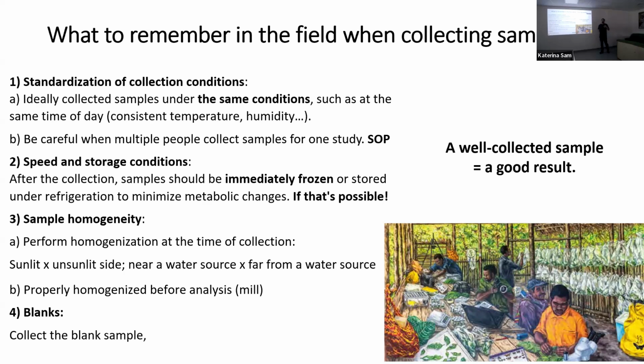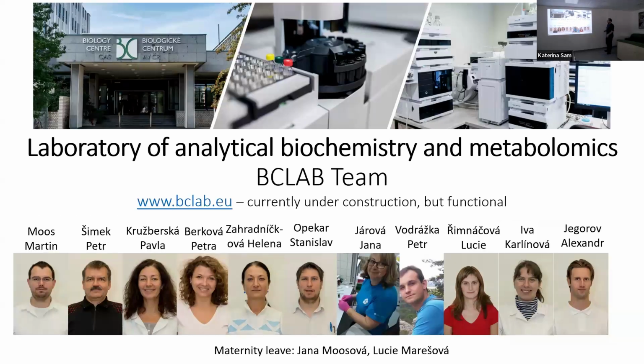Yeah, because we need the information about the contamination. If we don't have the blanks, we don't have this information, and there are a lot of peaks in your analysis. It's maybe contamination. It's not interesting for you. And typically, these peaks are very nice, very big, and perfect. But yeah, we need the blank samples.